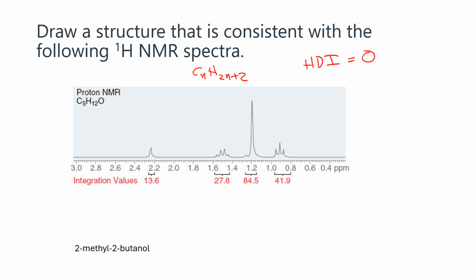So now I need to build something with that. What I have here is something like large. So it might be, I'm going to think of an isopropyl pattern, because I have an H here, and that will be, yep, here I have, let me see, not that.